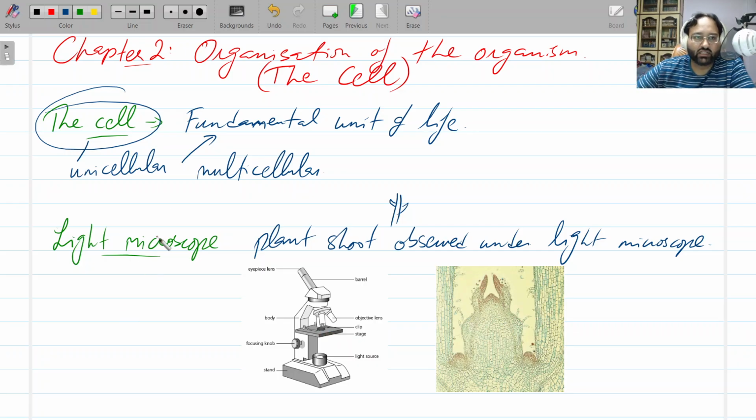So a microscope slide is a rectangular piece of glass, and in the center you place what's called the specimen. So some very small, thin part of a living organism. And on top of it you place a cover called a cover slip.